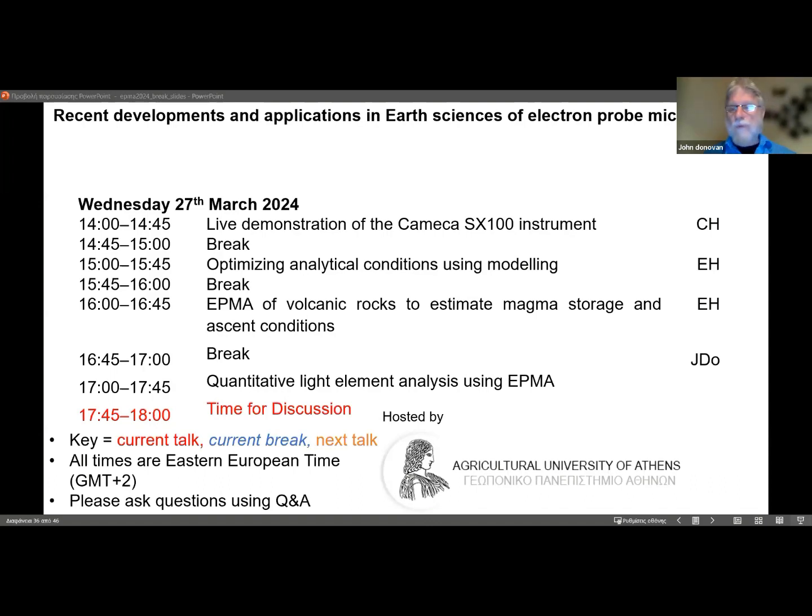And by the way, when you open in offline processing mode, you can open data files from Cameca instruments and data files from JEOL instruments. It doesn't matter. So this may be, let me sort alphabetically and see if I can find monazite here.